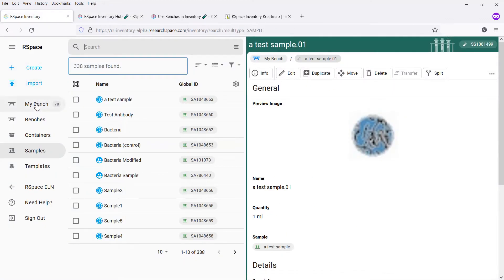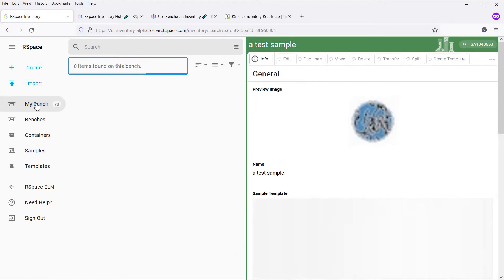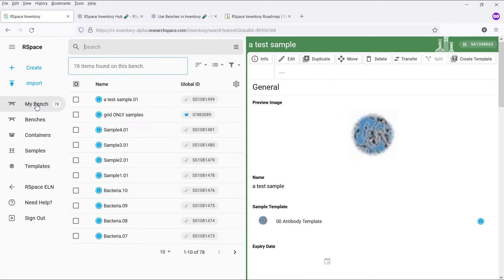A bench is a representation of your real-life personal scientific bench. It's a handy place for you to store items you are currently working with, such as subsamples and containers.